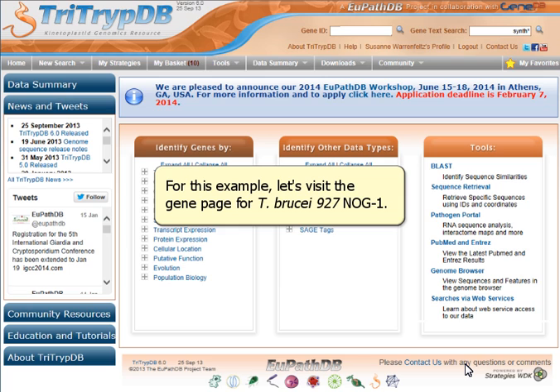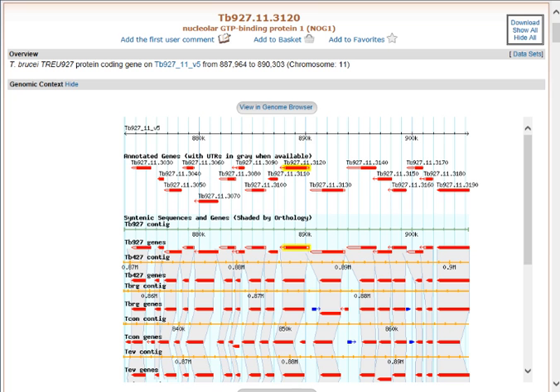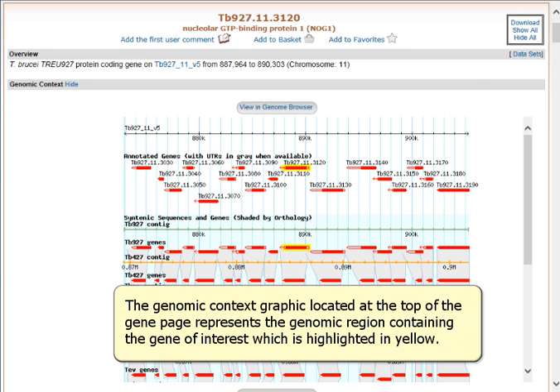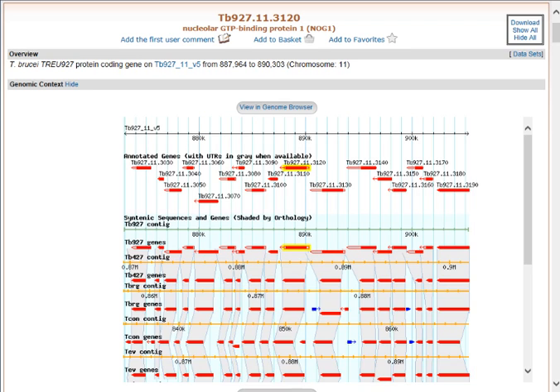For this example, let's visit the gene page for TBRUCI927NOG1. The genomic context graphic, located at the top of the gene page, represents the genomic region containing the gene of interest, which is highlighted in yellow.